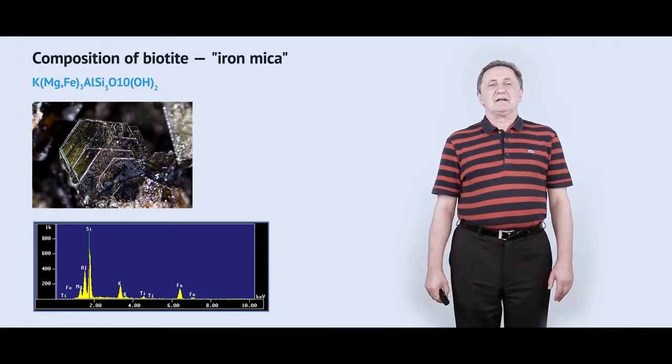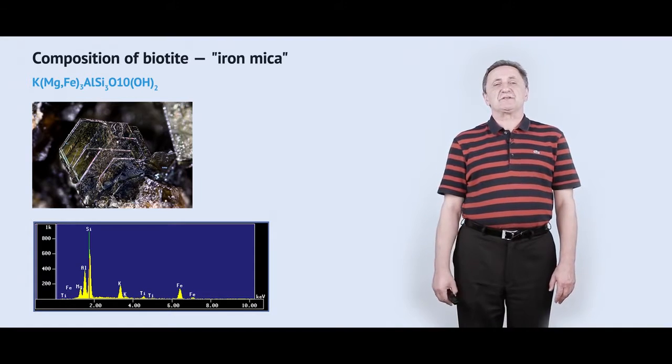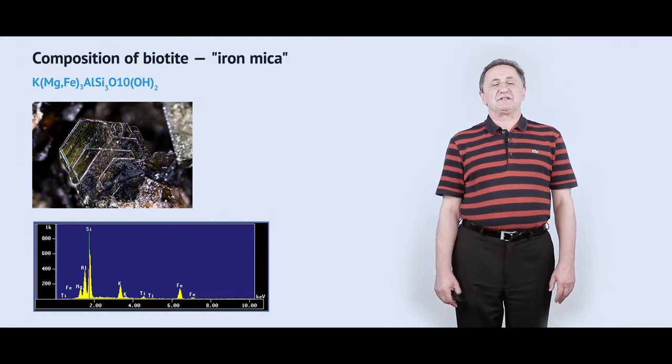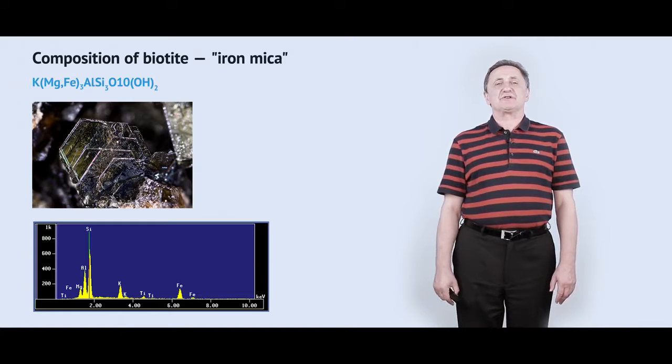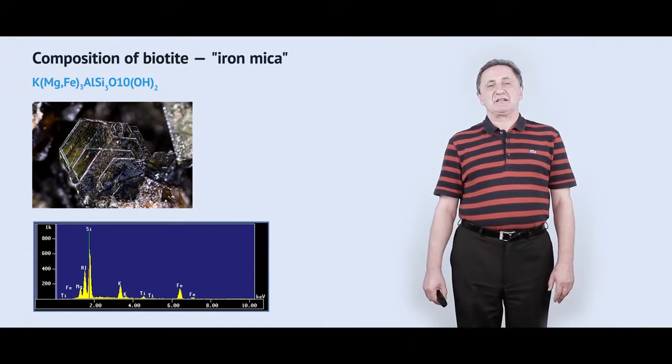In what form can you get these results? This is a typical distribution of energy peaks, which shows you the energy of the detected peaks and the number of photons grabbed with the corresponding energy.